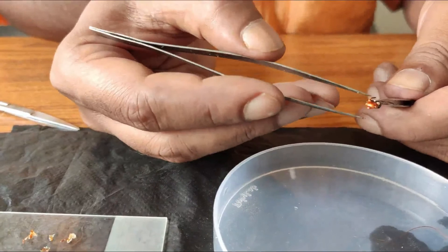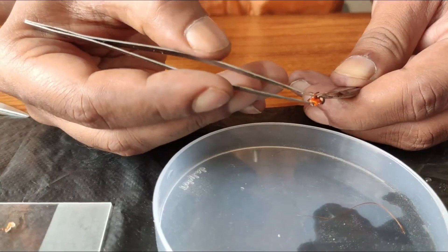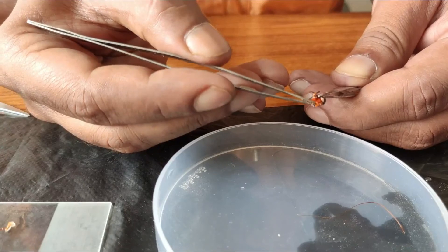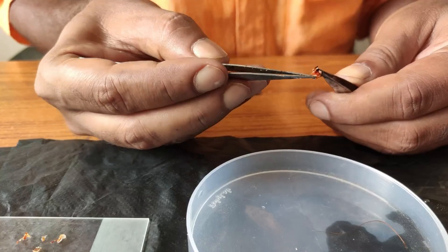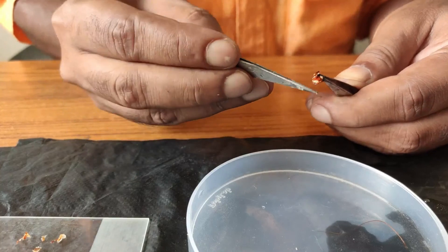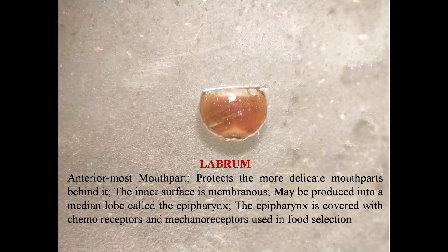Now going back to the dorsum of the head. This is the labrum — the upper lip — which also has to be removed and placed on the slide. And this is the labrum.